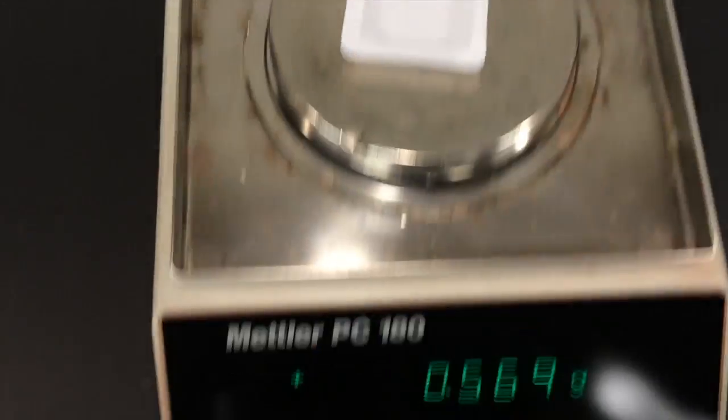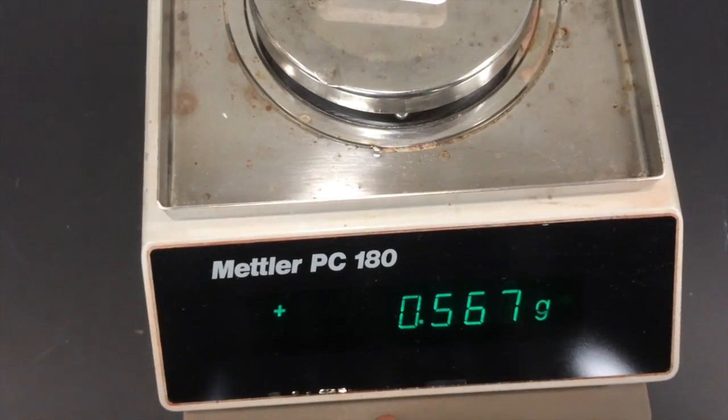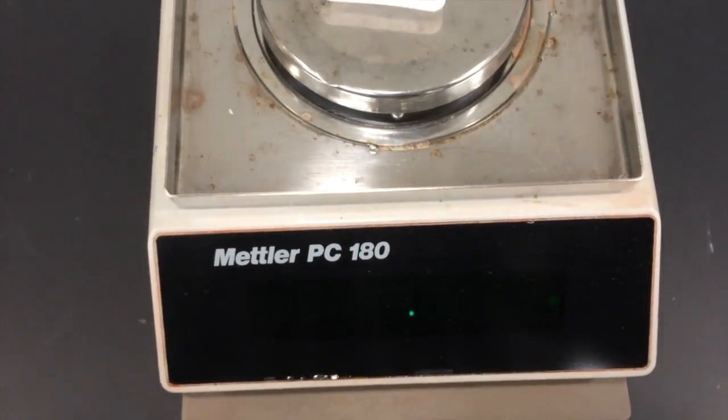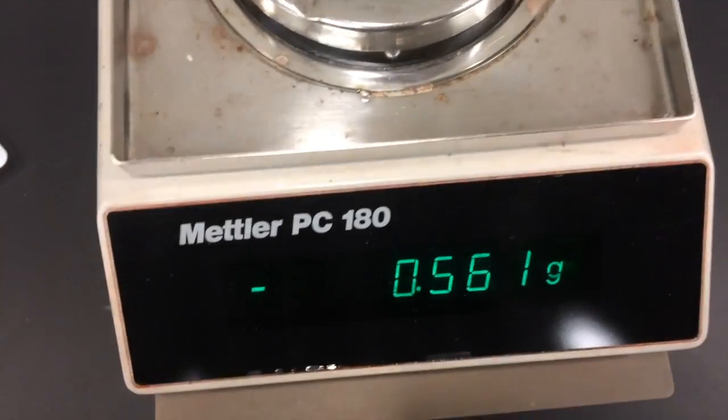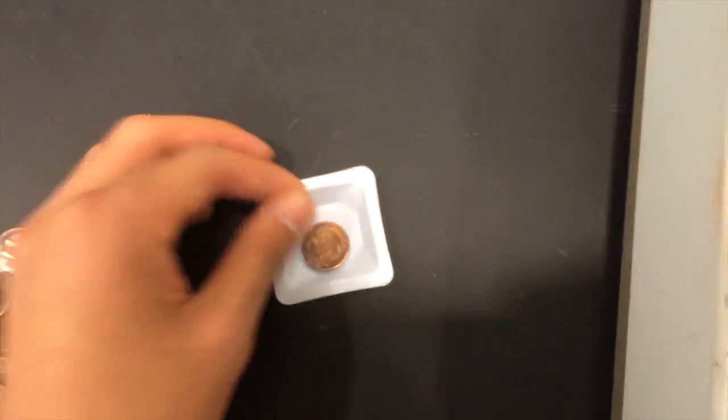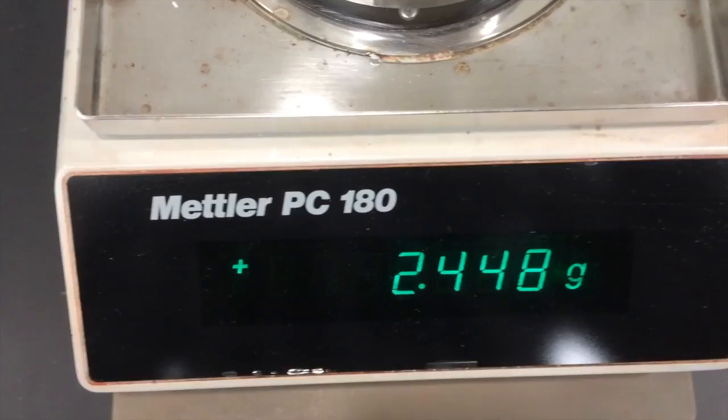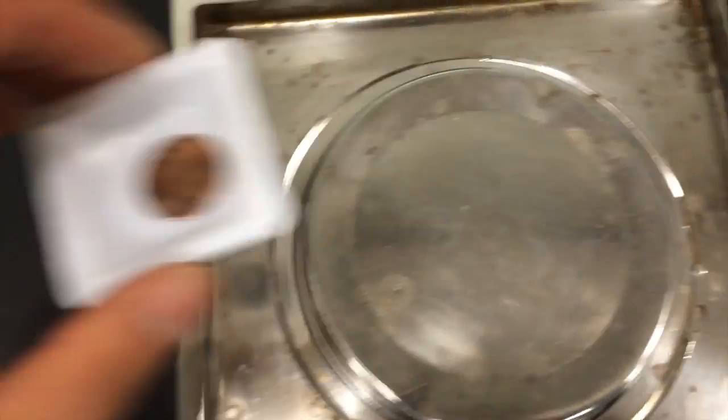To weigh your individual pennies, go ahead and zero your scale using the tare function, and then put each individual penny into the weigh boat. This works best if your lab partner records the year of the penny while you record the mass of each penny.